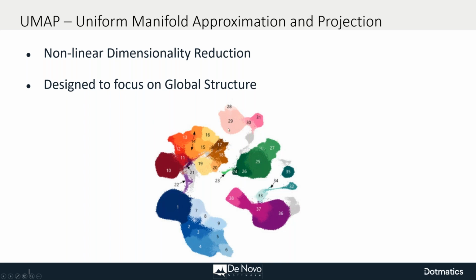So essentially, after you run these algorithms on your data, if you use phenotyping channels in the setup of these algorithms, then you will end up with each island containing a different subset of your cells. And so this happens to be a UMAP figure from OMIP-069, which is a 40 color phenotyping panel.